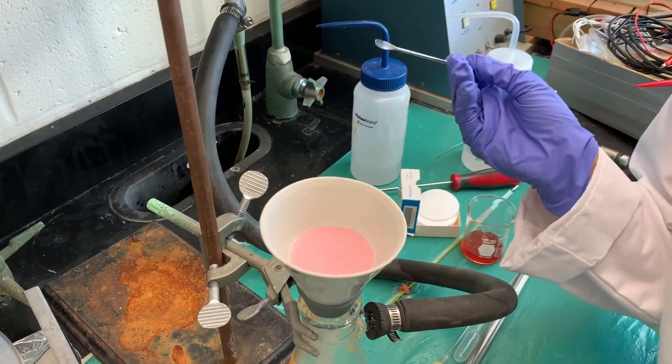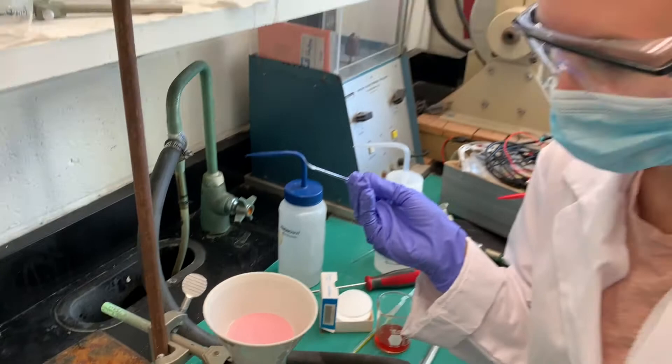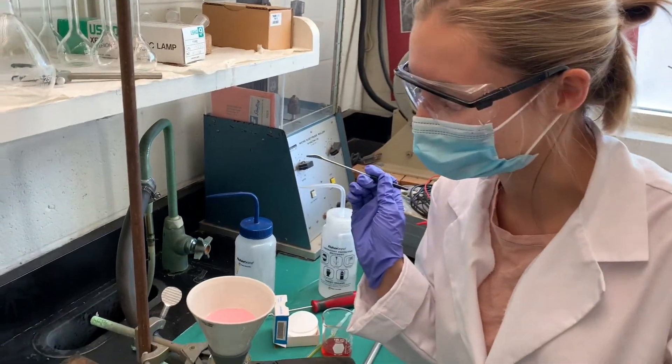We've successfully synthesized our nickel bippy compound, and here are the light pink crystals to prove it.